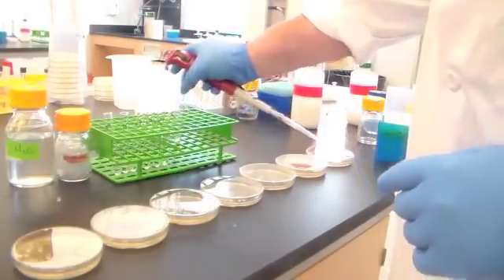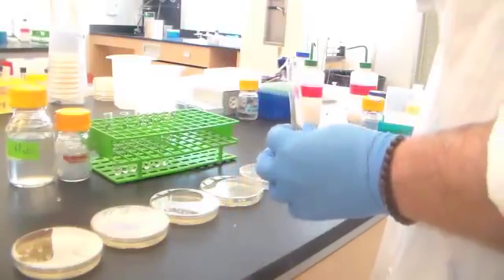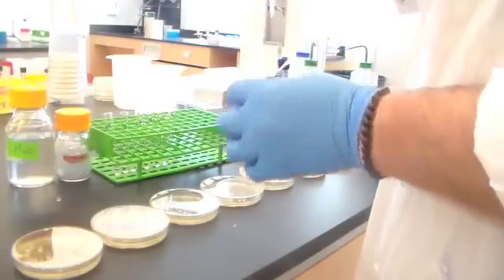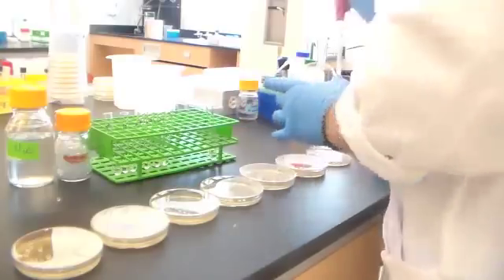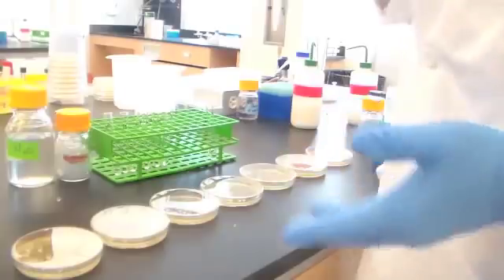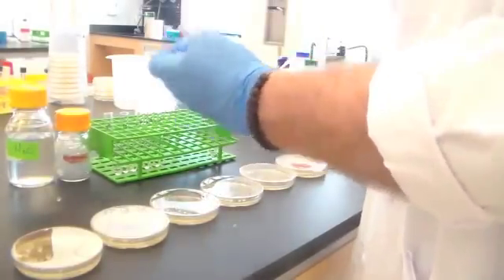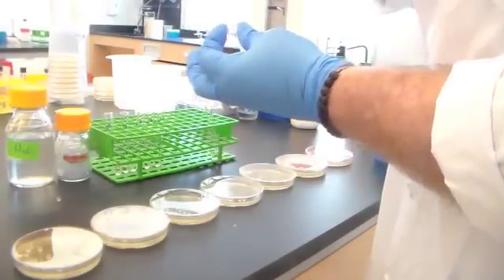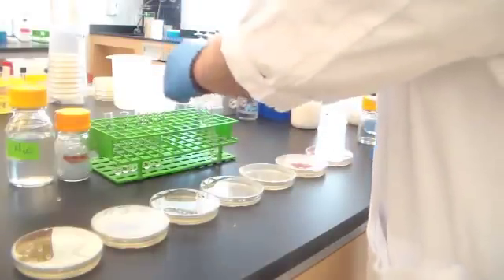What I'm going to do is I'm going to now start from the most dilute, the 10⁻⁷. I'm going to take 100 microliters from that very dilute. Perhaps there's not even any bacteria in there. And I'm going to plate that onto the 10 to the minus 7th plate that already has the beads. I don't need to change pipettes now because this had so few bacteria and this has 10 times more, that if I go into this 10 to the minus 6 tube, I can use the same pipette. I'm just going to mix them up a little bit.